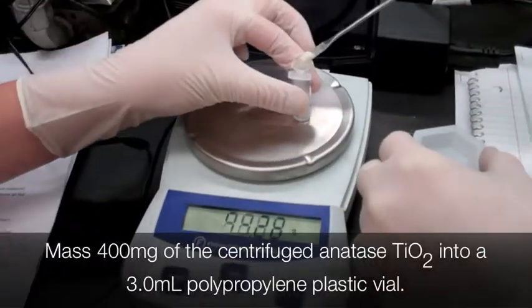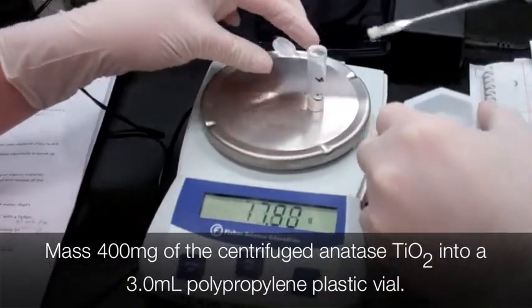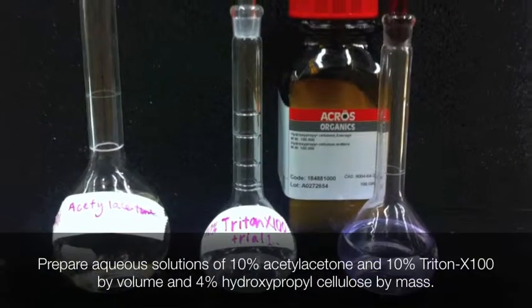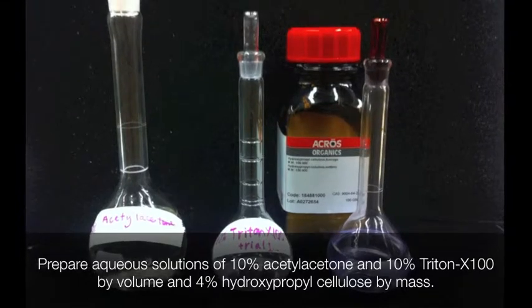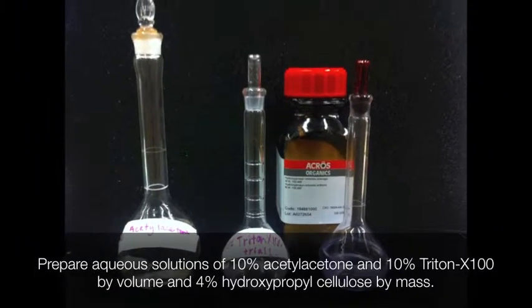Add 400 milligrams of the centrifuged anatase titanium dioxide to a 3 milliliter polypropylene plastic vial. Mix one 10% solution of acetyl acetone, one 10% solution of Triton X-100, both by volume, and one 4% solution of hydroxypropyl cellulose by weight, and let sit overnight.